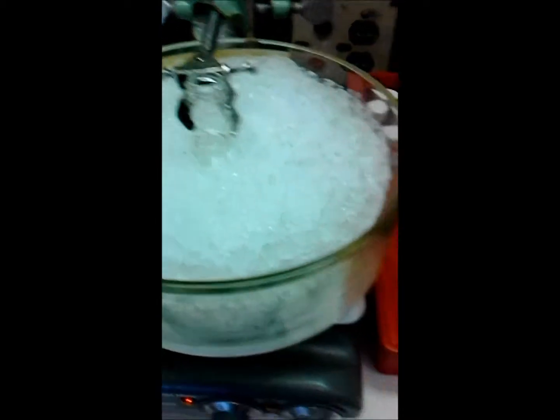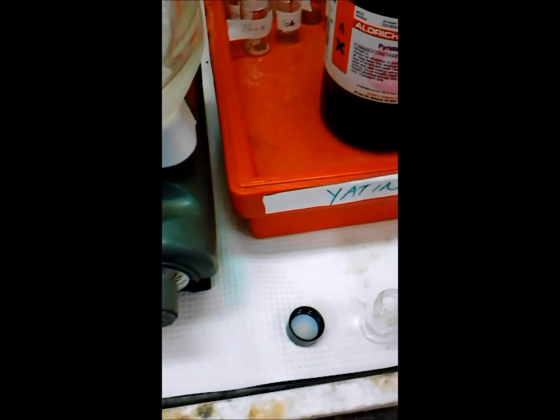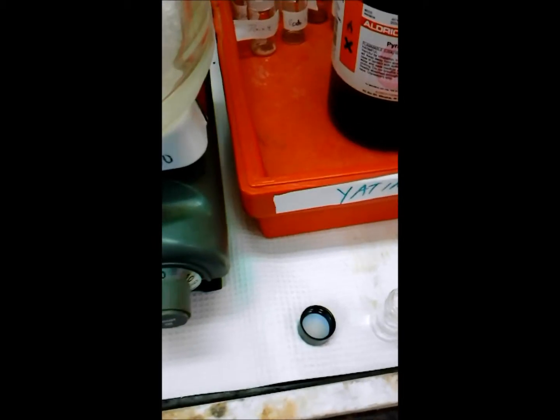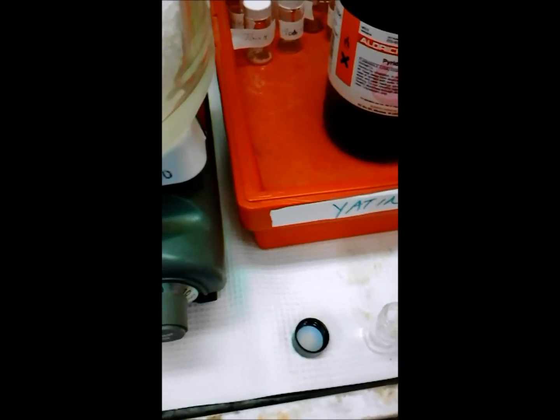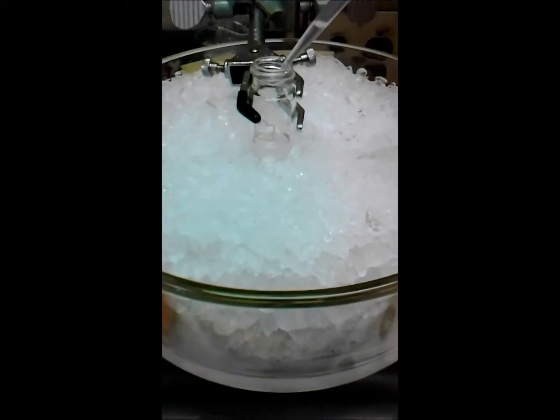Okay, so the pyridine has been added, and now we're going to add some of the acyl chloride, which is diluted in DCM, to the reaction mixture. This should theoretically turn it orange.